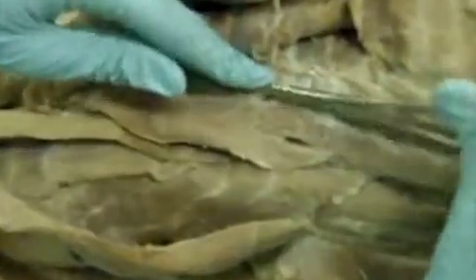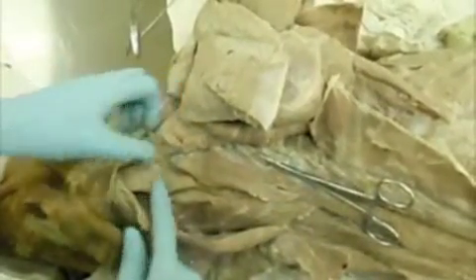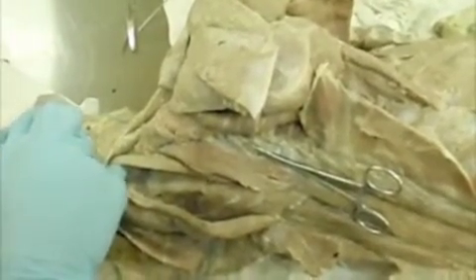So here, I'm going to put the forceps for the demarcation between the iliocostalis and the longissimus system. So the longissimus here, you can see it fans out and goes to your cervical vertebrae, and then out of nowhere comes this capitis part here that goes to the head. Okay.